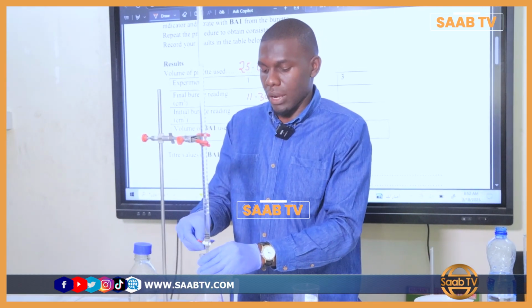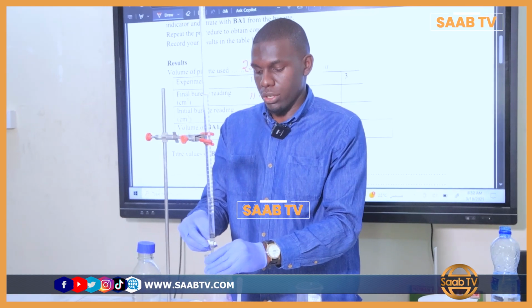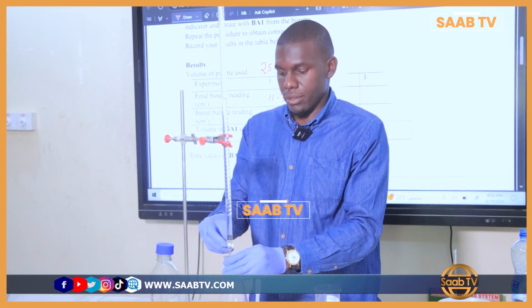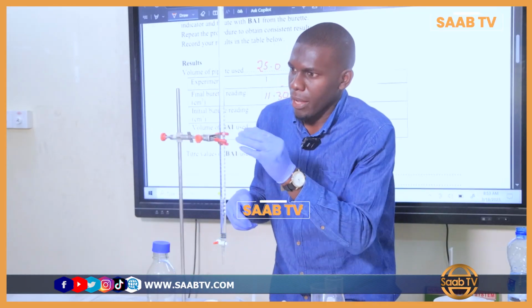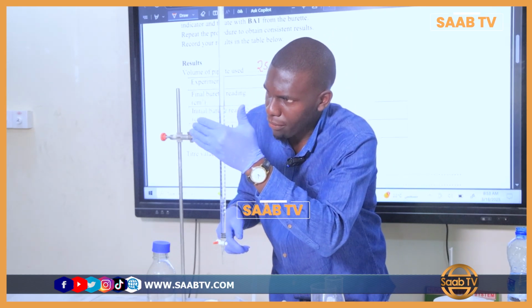So I titrate again. We run the acid from the burette as you keep on swirling the flask. So you take a keen eye such that you don't add in excess. So I'm just close to the end point. I need to add in now drop by drop. So my reading here is at 22.5.